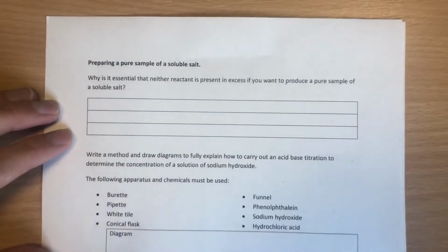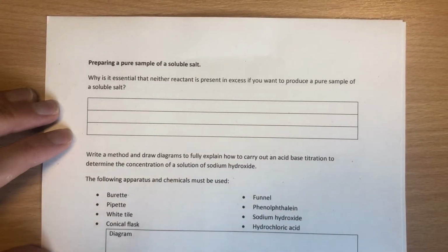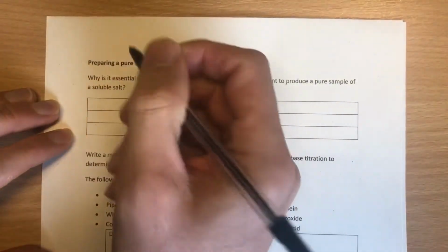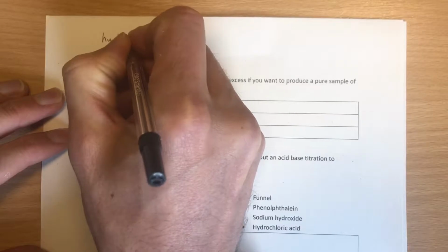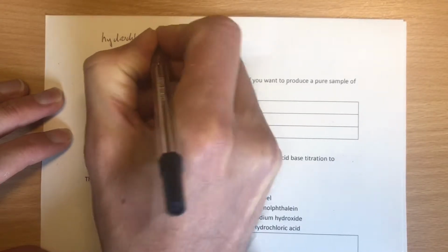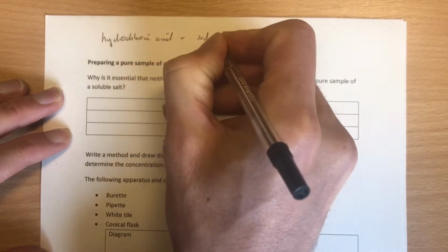In this video, we're going to look at how to do titration between an acid and an alkali. If you think back to year 10, we looked at neutralization and we looked at hydrochloric acid. It's a very simple neutralization. Hydrochloric acid, HCl is its formula, reacting with an alkali, sodium hydroxide, a very common alkali.